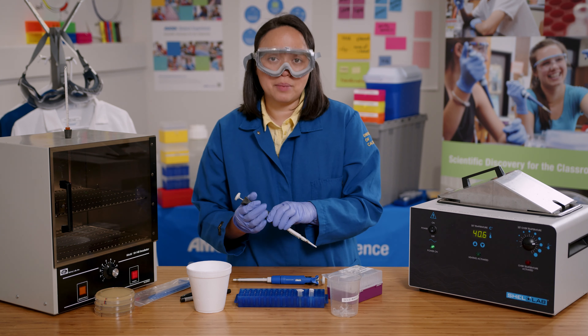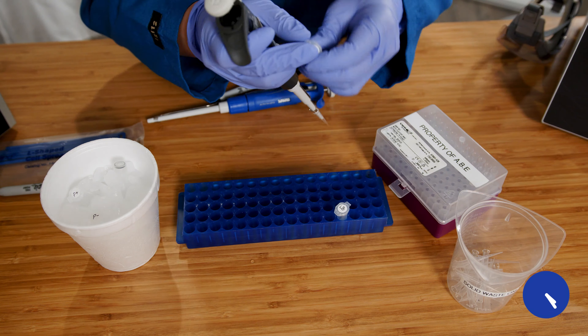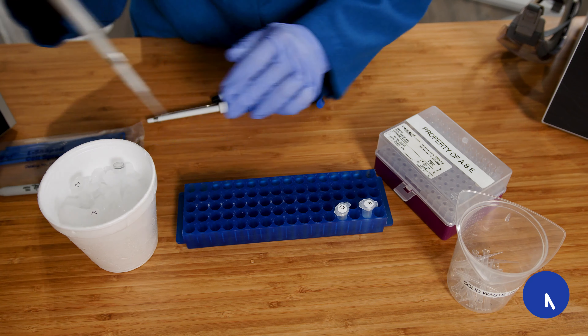Next, I will add 10 microliters of the plasmid to the experimental tube. Then I'll let everything sit on ice for 15 minutes.